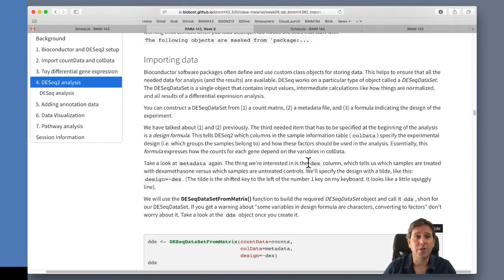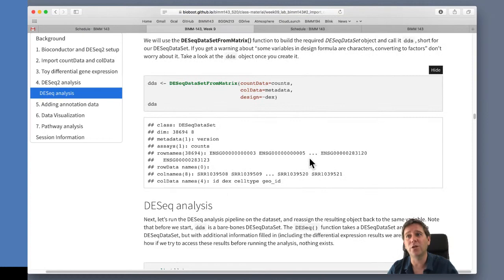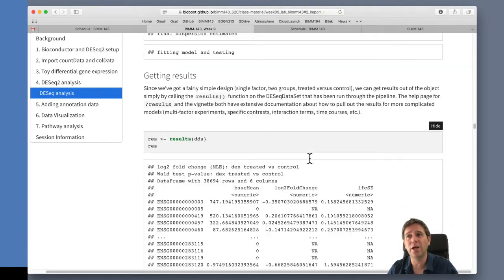We'll finish off here with a DESeq analysis of this. We'll see that it's much easier. What it does under the hood is calculate this log2 fold change, but it also does the statistics. That's the thing we're missing. We haven't actually said whether this difference in the means that we're calculating is significant. So DESeq2 is going to do this. It uses negative binomial statistics, similar to the binomial where we can flip a coin and see these kinds of statistics. That's the kind of distribution we'll use.